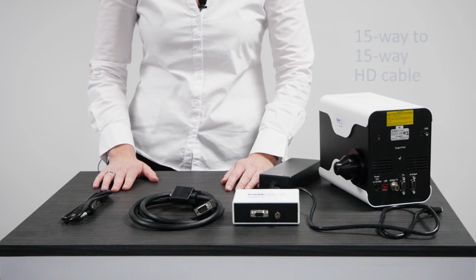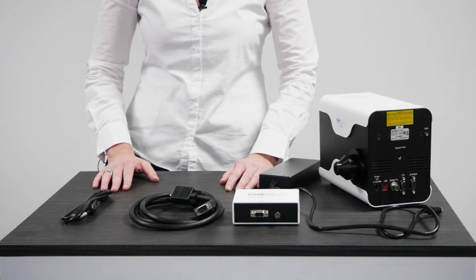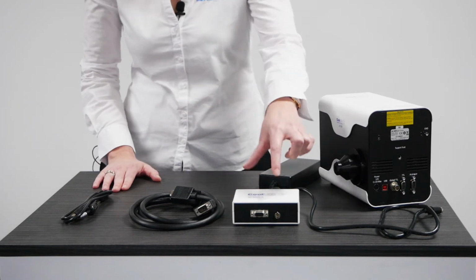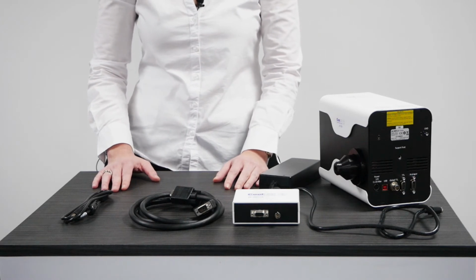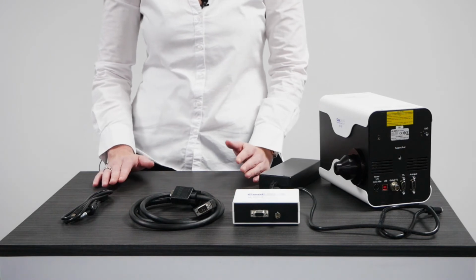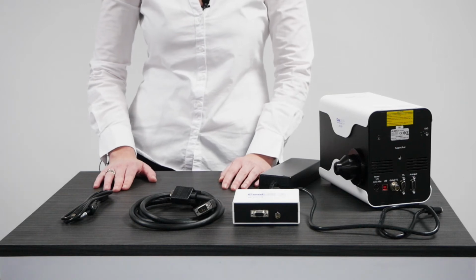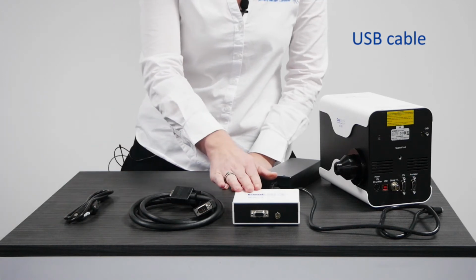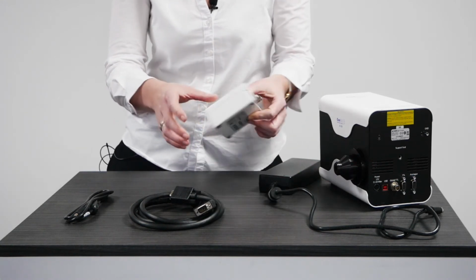Here the TTL controls the on-off state of each channel, and the pins are also in order, which allows for easy software setup. There is also a global TTL connection using this BNC connector here. And in some software, such as Micromanager, this allows for the setup and control of additional hardware, such as the PT-100 for transmitted light applications. Finally, there is a USB cable included, which connects the pE-6501-8 to a PC using this connector on the back.